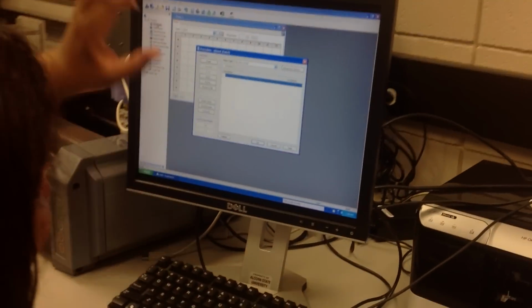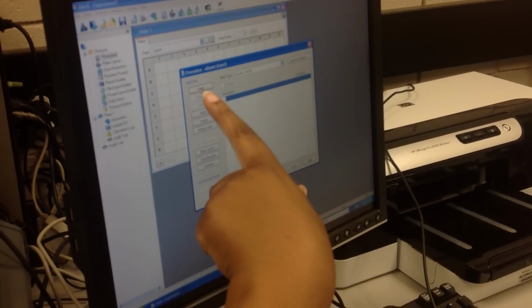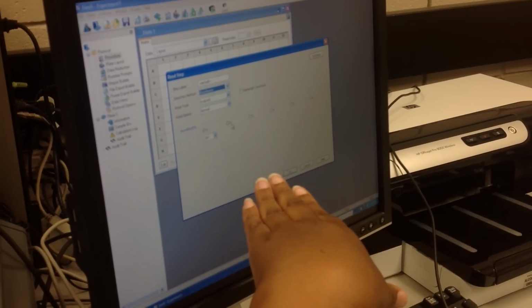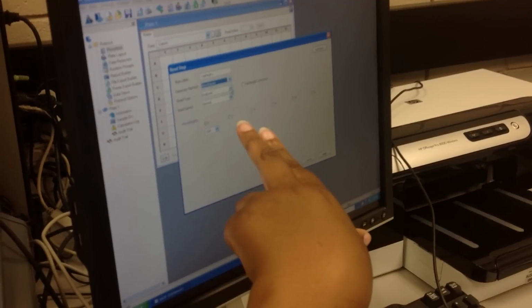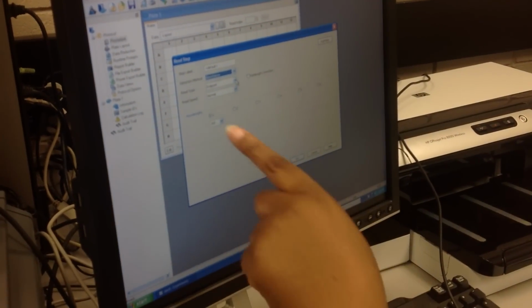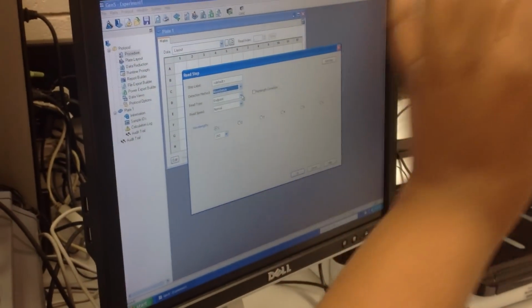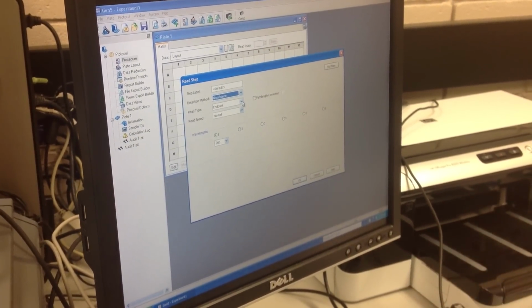Okay, so that's that. I told you all that so I could tell you how to determine how you're going to do your protocol. So now after you've clicked on procedure, you're going to go into read. So double click on that. You want to do an absorbance spectrum, which is just saying measure the absorbance at every wavelength. You're not going to do endpoint, because if you're doing endpoint, you would have chosen 5 or 6 specific wavelengths that you want to measure, and it would just measure the absorbance and give you one number for each one.